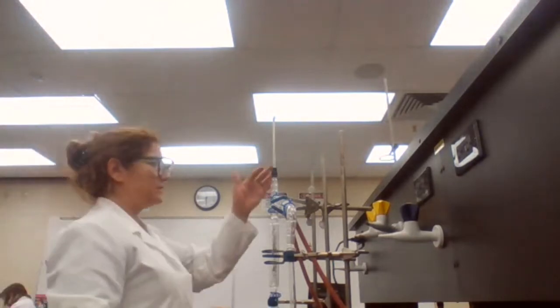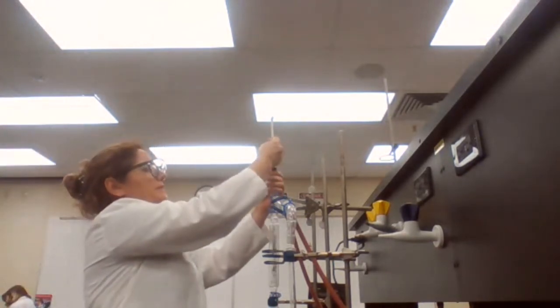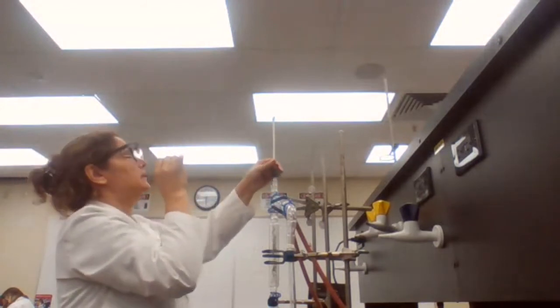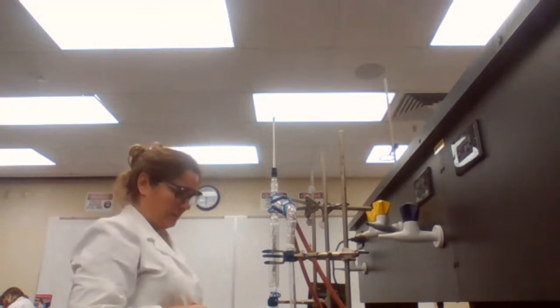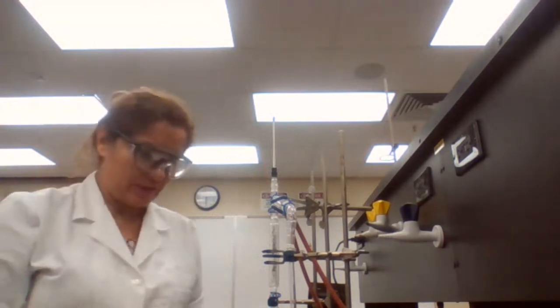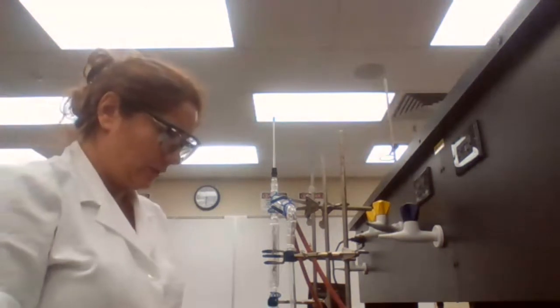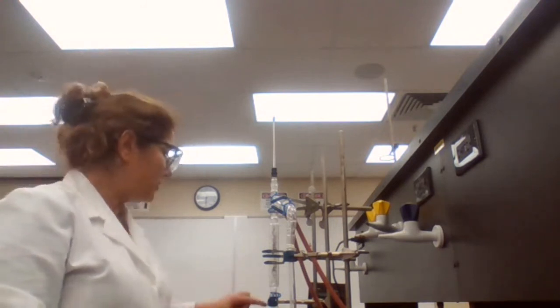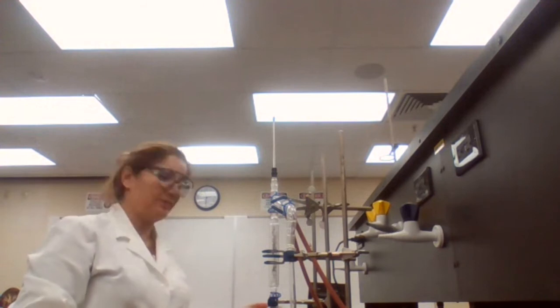Why do you think the temperature is dropping between the two distillations? That was a question on your pre-lab as well. The temperature is dropping. Is the solution getting cold for the temperature to drop? But the temperature of the solution would still be high, right?